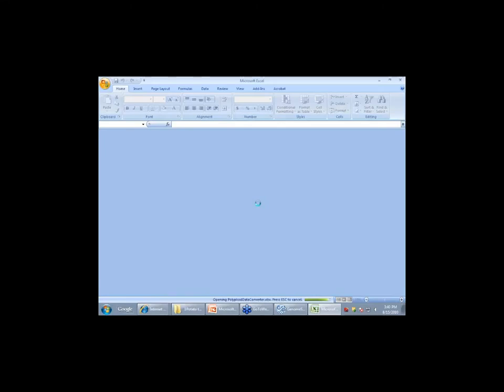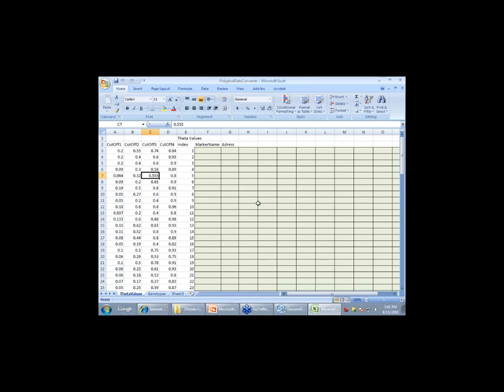This is a file that my technician or graduate student in my lab put together with a series of macros that can use the theta values to make the calls. So everybody should come up with this file over here. Basically, what Kevin Stoffel in my lab has done, he's looked at the theta values and said cluster 1 is going to be at 0.2 for this SNP, 0.55 will be cluster 2, and so on. He's captured the theta values that are in between each of the clusters for the files. And then he's got a series of macros which you don't need to know about.